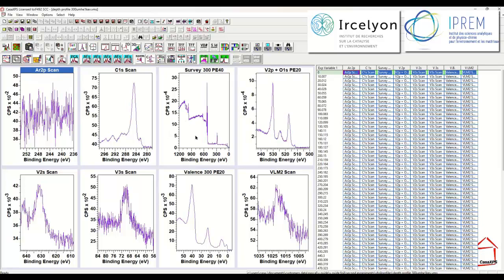The reason that I wish to do this is because I'm interested in the background as well as photoemission peaks. So I have narrow scan spectra. These all provide information about the chemistry of the sample, but when I want to understand the relationship between these different materials and layers within the sample, then the background can be very useful. Now, it may not be fully quantitative, but as a qualitative test to understand the nature of the sample, considering the background is not a bad way to go.